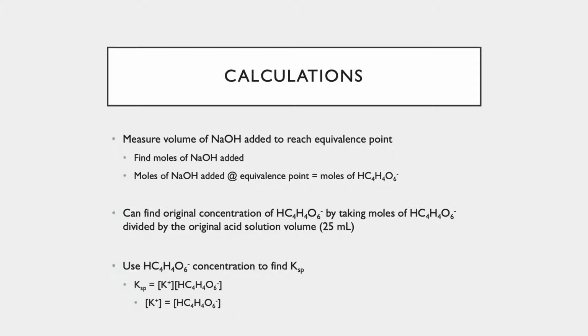And so the experiment for this week, it's some new experience getting to use a burette. We'll also have a graduated pipette that you'll be measuring out some acid solutions with at the start too. That might be a little new, but that's not too bad to go through and see the first time. And so a couple new things, but the actual lab itself is relatively short.